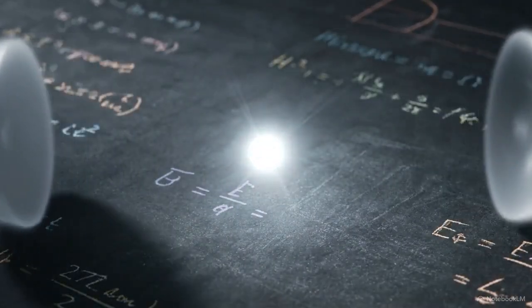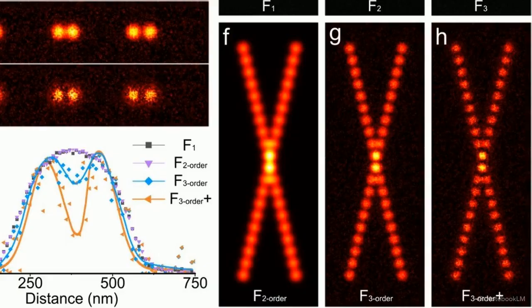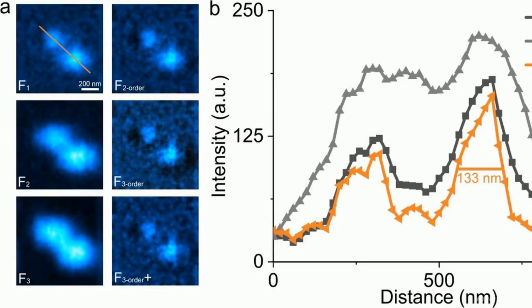These colorized simulation grids test the algorithm against synthetic continuous cross-line structures, populated with emitters spaced down to 130 nanometers. Comparing the outputs, second-order processing isolates the general shape, but third-order Fourier-modulated processing accurately pinpoints the intersections, resolving the structural lines into distinct positions. Moving from simulation to in vitro experiment, this image panel compares the imaging of single scattered nanoparticles on a cover glass under varying excitation powers, from 0.1 to 0.3 milliwatts.